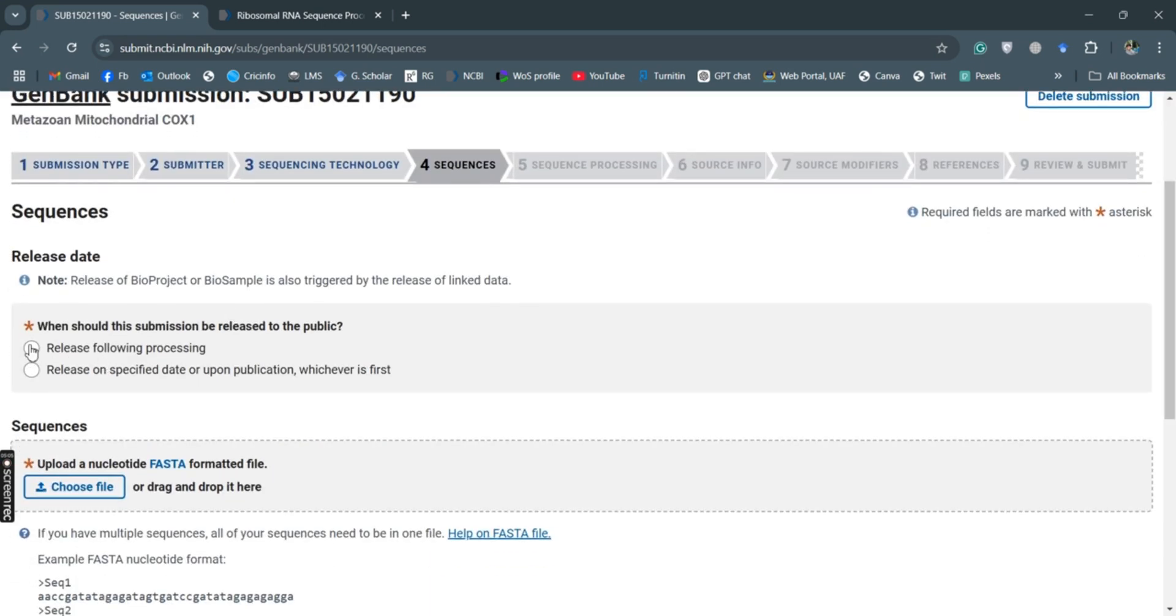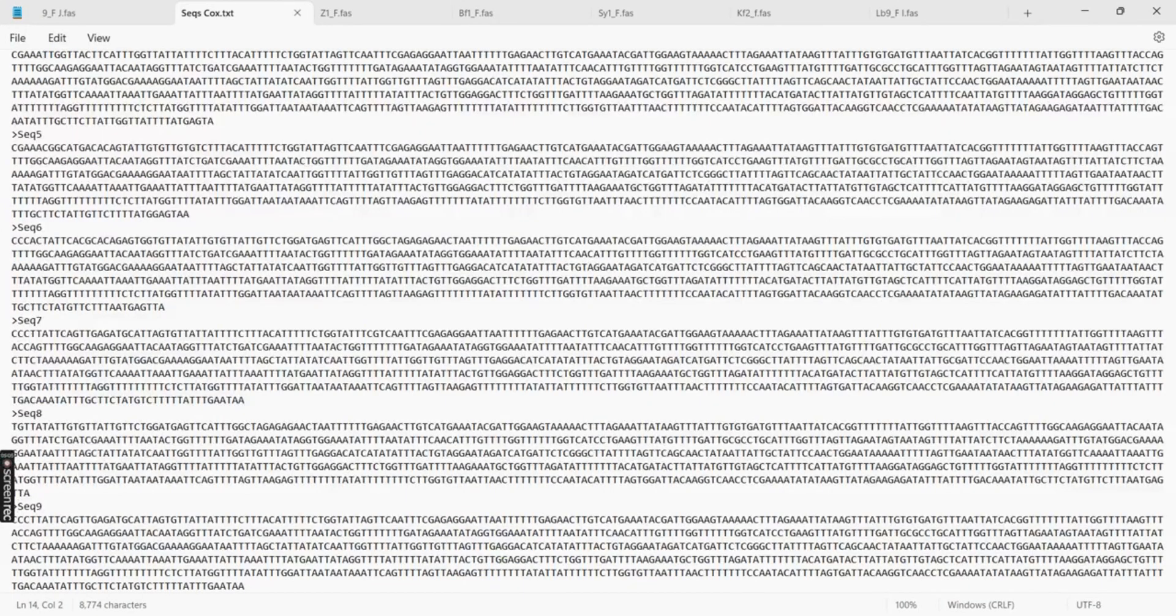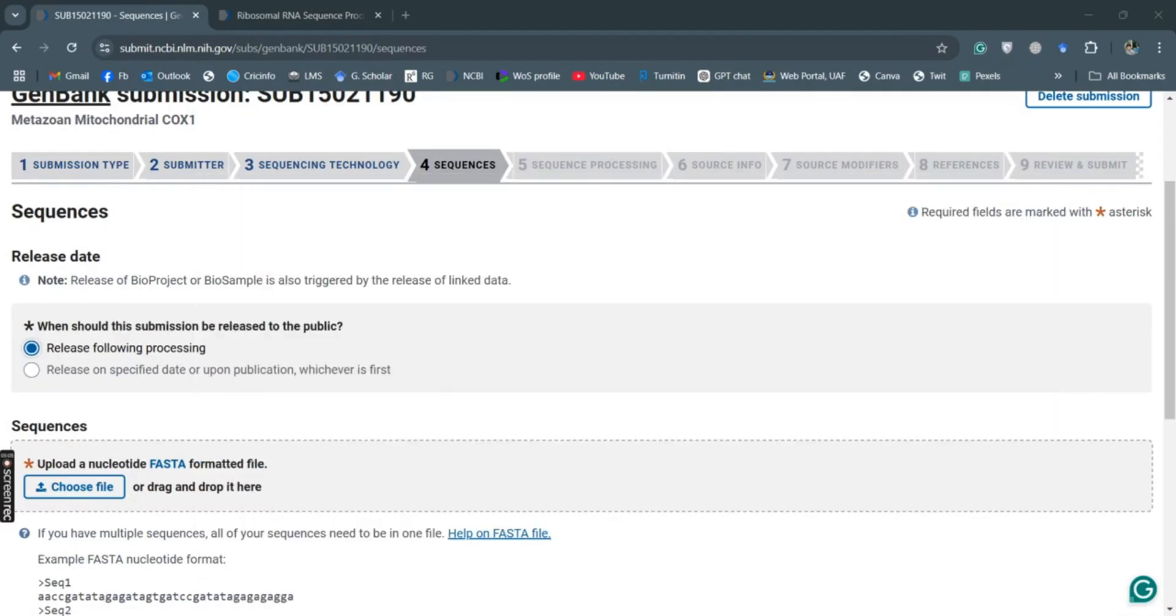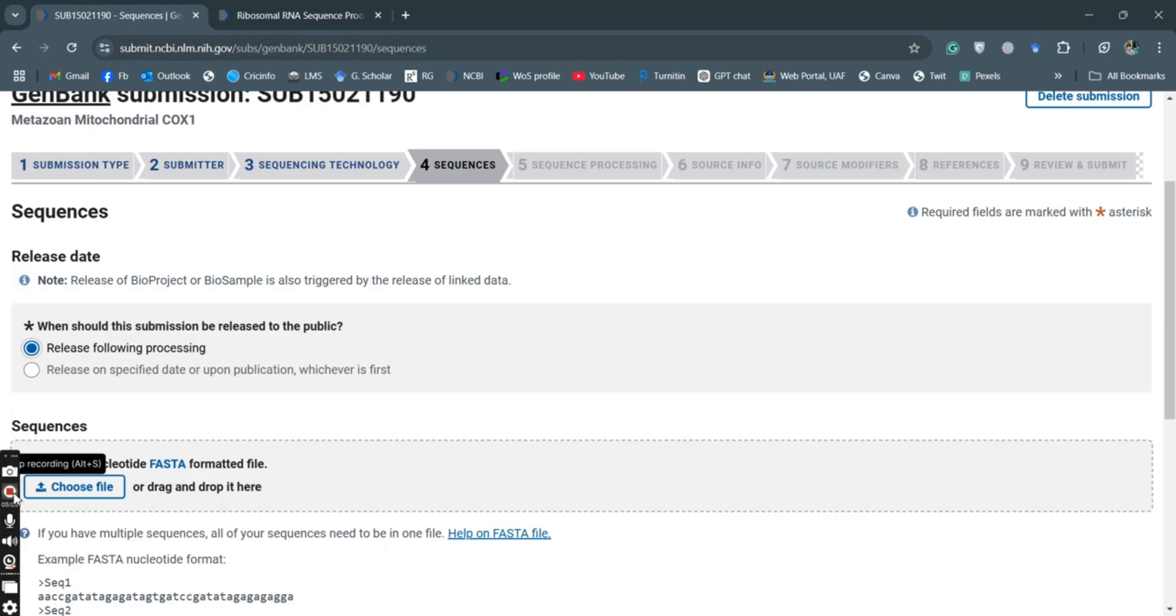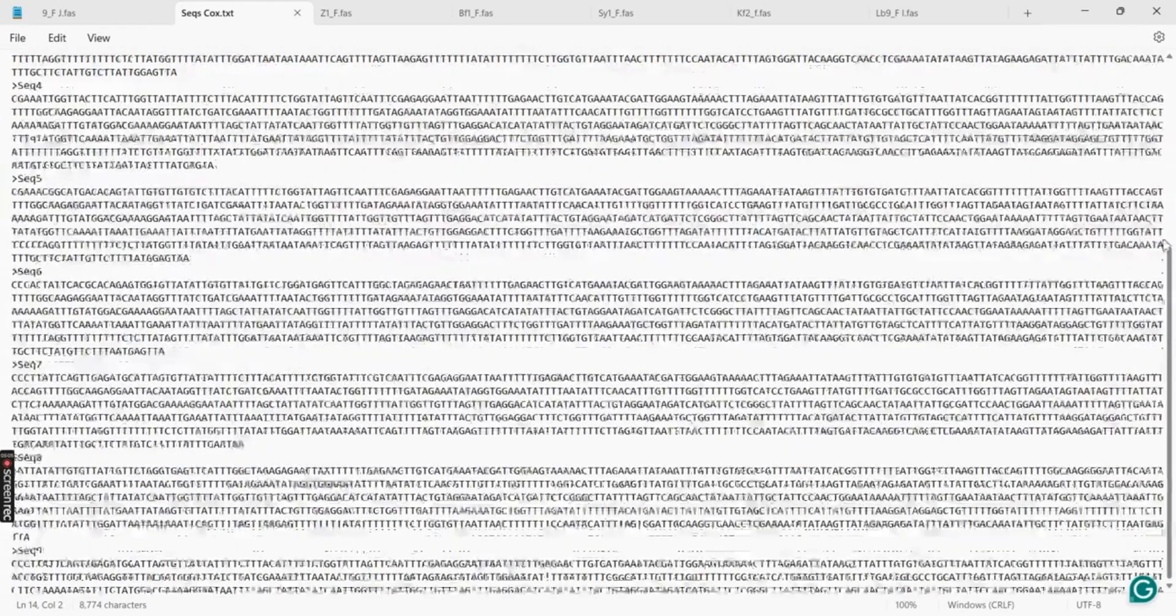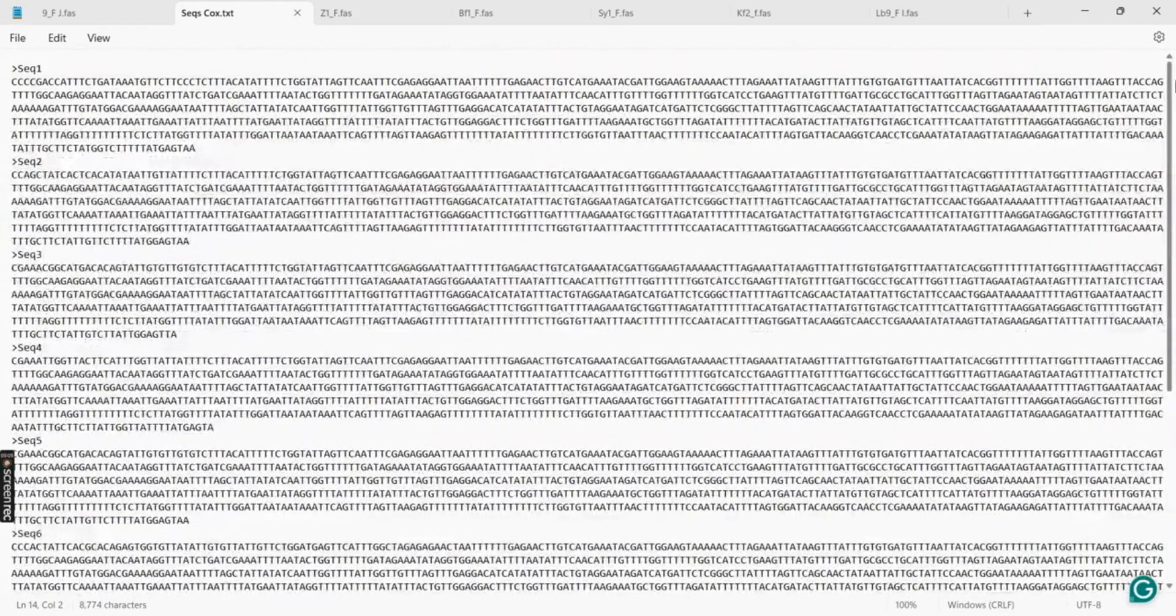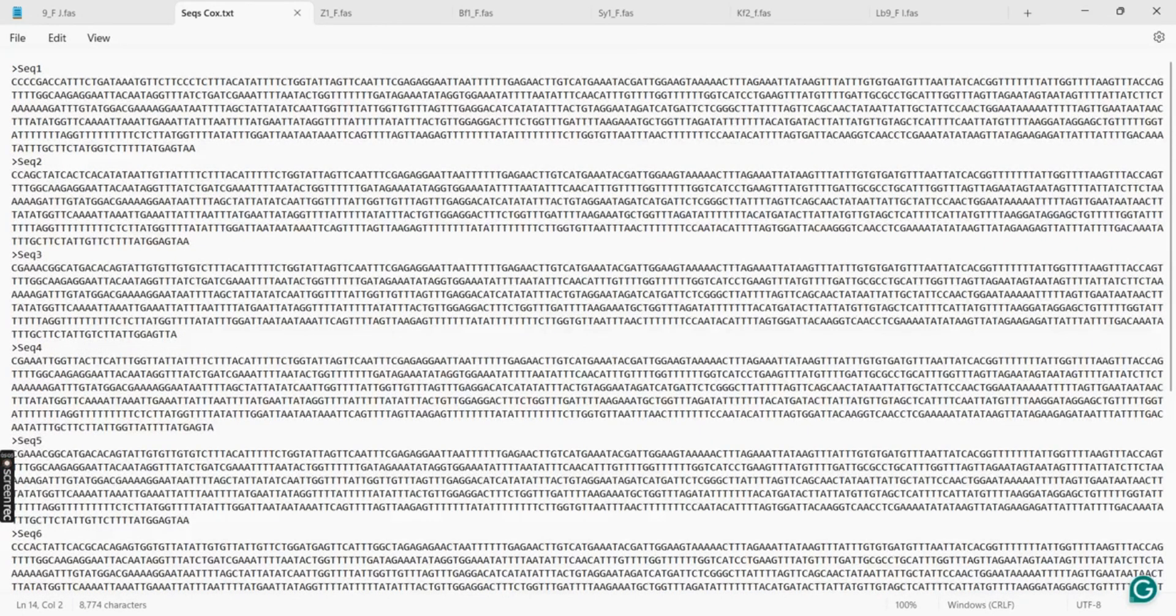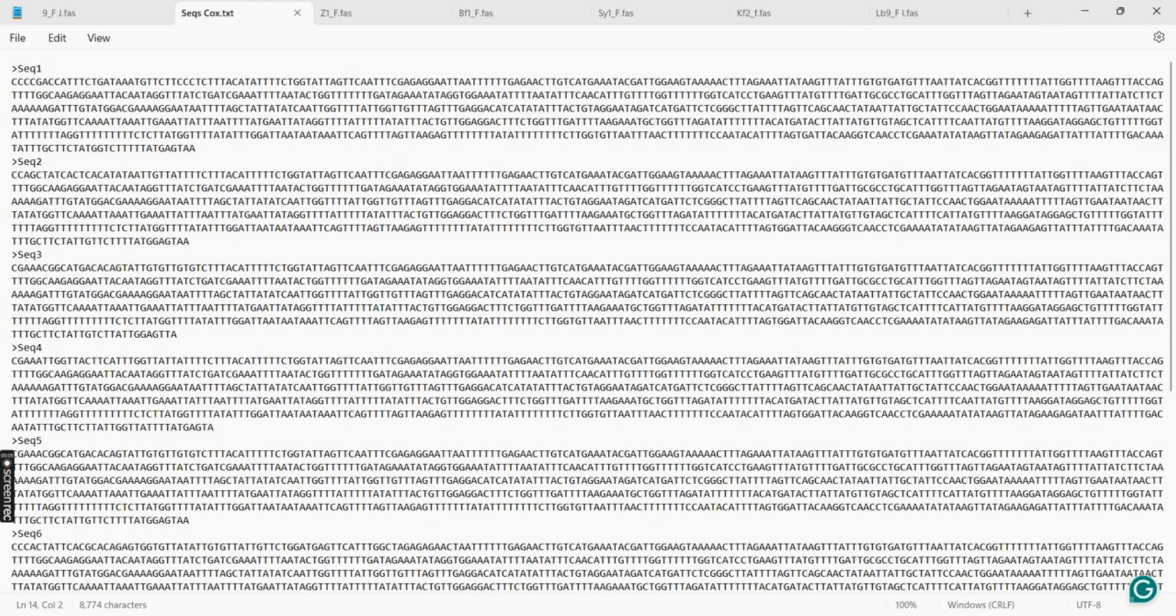Release following processing. So I have already developed this FASTA file. You can see here the FASTA file. This is our FASTA file already developed for nine sequences: the second one, seq two, seq three, seq four. And I will use this file uploading.